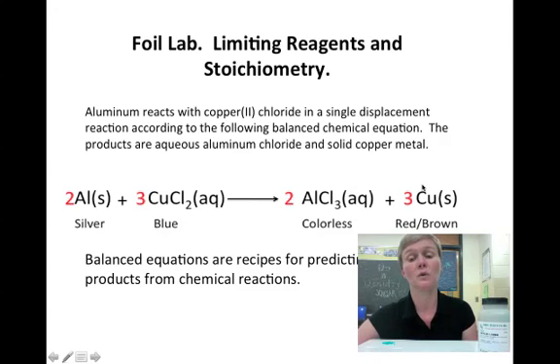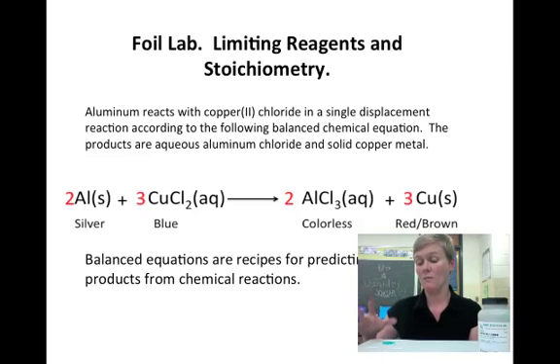And if you pull a penny out of your pocket, you'll remember that copper is a reddish brown solid, and we're actually going to get the copper out of copper chloride, which is a blue crystalline beautiful compound, and we're going to do a single displacement to get it into the copper solid form.